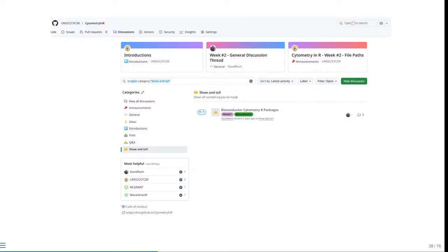Part of our take-home question was, how many Bioconductor packages exist in GitHub. Around that point in time, I was a little bit curious about how many previously flow cytometry related packages had been in Bioconductor but have since been discontinued just because they have been deprecated. So in messing around with trying to get that data set out of Bioconductor, I also ended up getting all that same information about how long each flow cytometry package has been in Bioconductor.